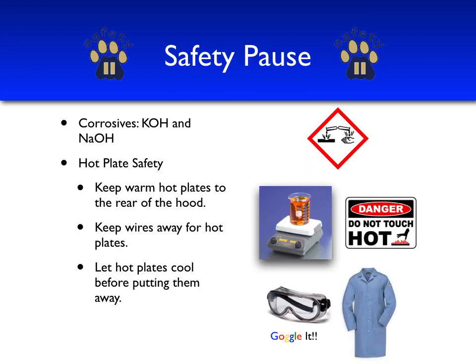In today's safety pause, we note that potassium hydroxide and sodium hydroxide solutions at a 1 molar concentration are moderately corrosive, and special care should be used when handling them. We also note a little bit of hot plate safety. In this experiment, we'll be using a warm hot plate to warm up our solution of KHT in pure water. We want to make sure that we keep the warm hot plate to the rear of the hood to reduce the risk of the hot plate being tipped over, causing a scalding injury.